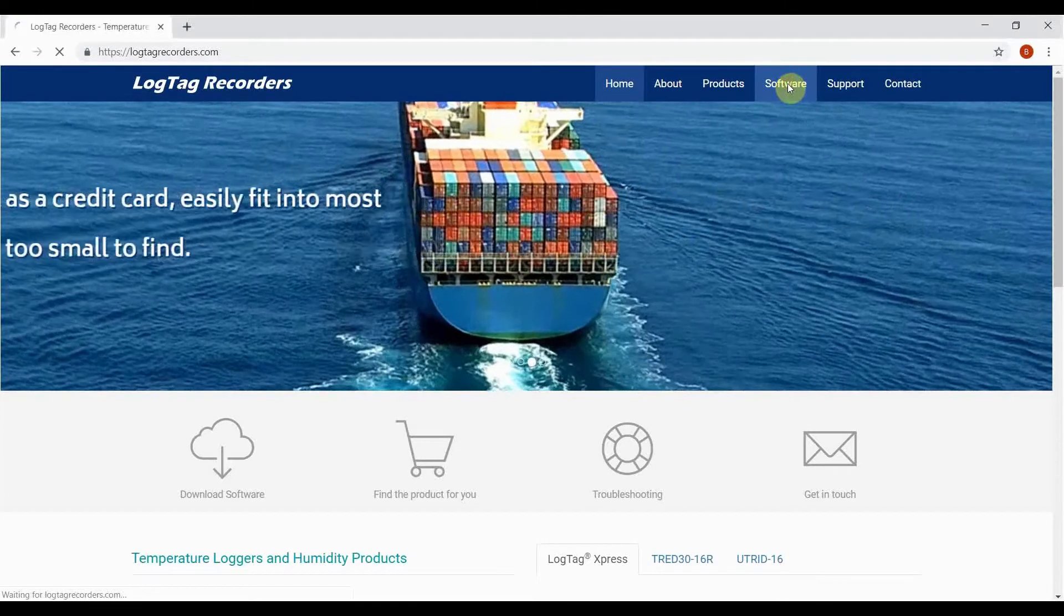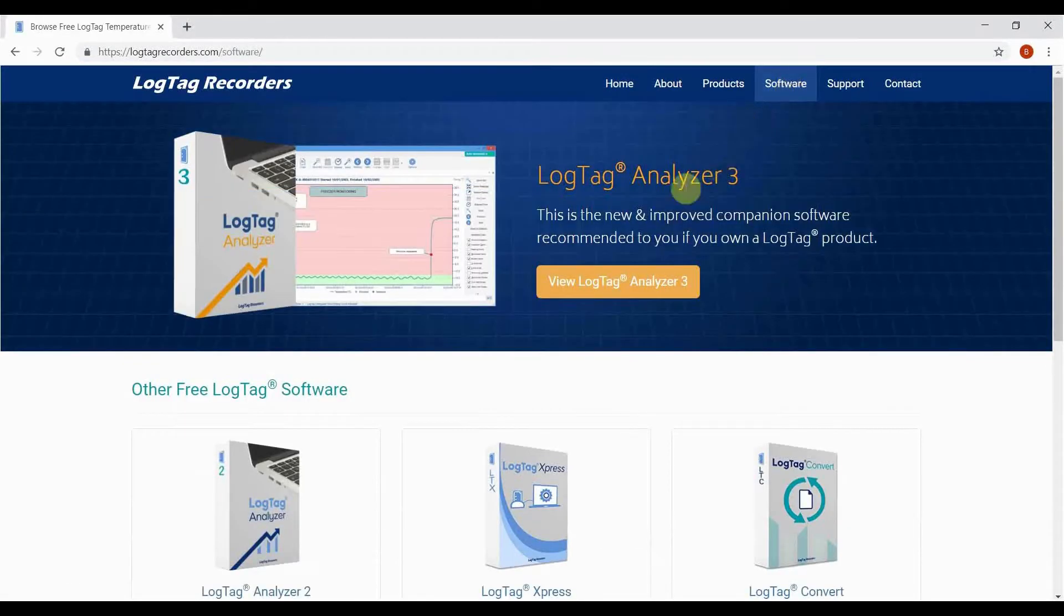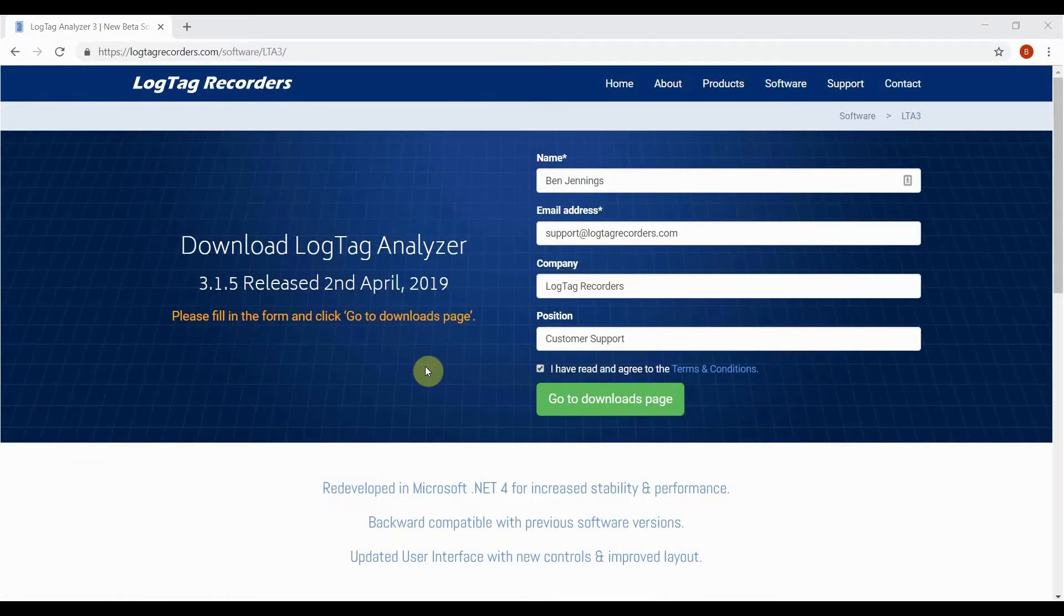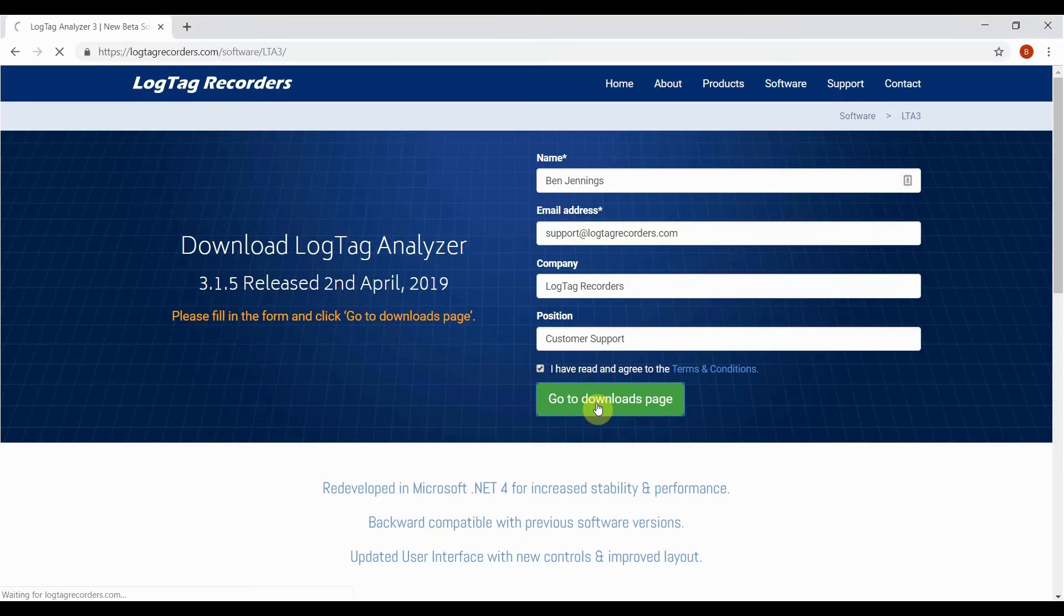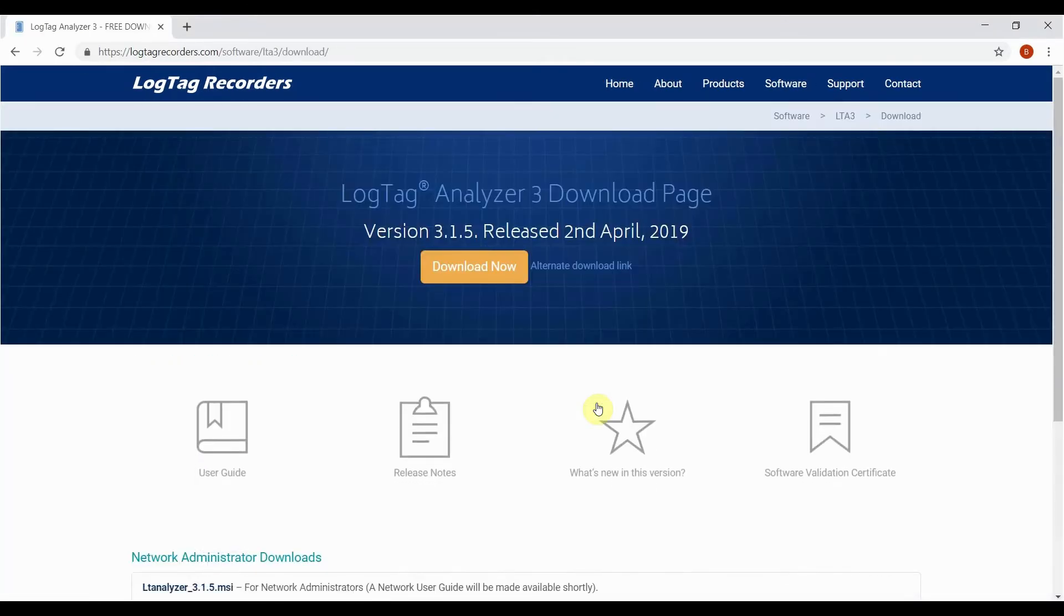Navigate to the software page and click on LogTag Analyzer 3. Enter your details into the form and click go to the downloads page. Finally, click download now and the download will begin.